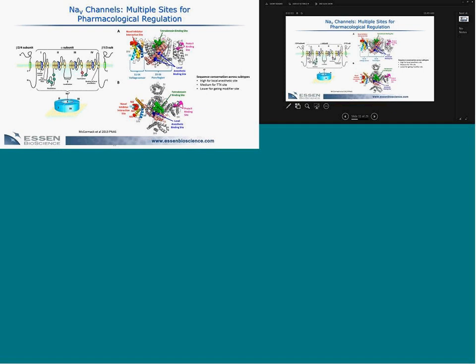In contrast, amitriptyline, which is a drug that's active in a number of rodent pain models, has a number of other pharmacological effects, but one of them is to block sodium channels. And you can see in a similar experimental protocol, it blocks better during a chain of action potentials. So this has something to do with why it can be effective in pain models at doses where there are very minor off-target effects. So that's the idea behind it.